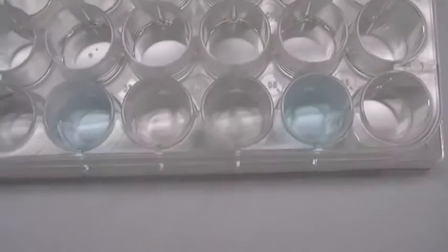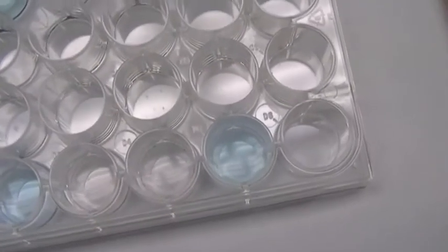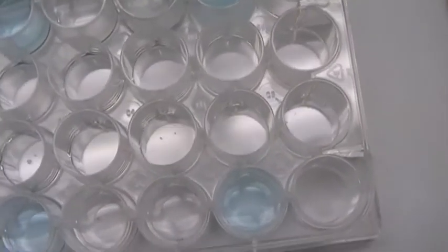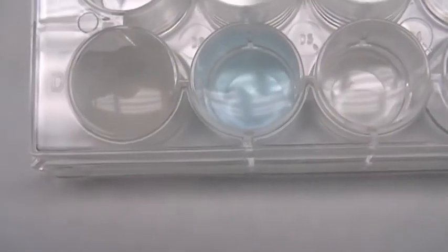All right, so now we have the same 5 solutions down here, but this time we're going to add ammonium hydroxide. And I always tell people, if you get tired when you do the lab, take a whiff of this, wake you right up. All right, so we're going to add ammonium hydroxide to our silver nitrate. And so you have a formation of a precipitate, sort of. It's more of a cloudy. It turned cloudy. Interesting what's going on there.